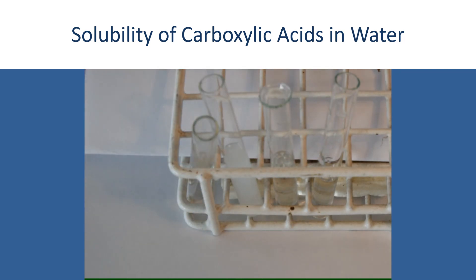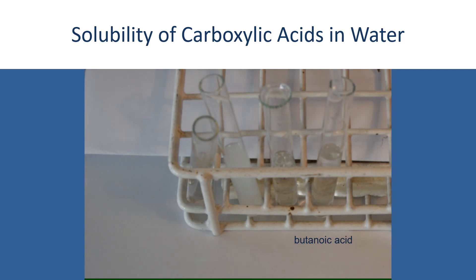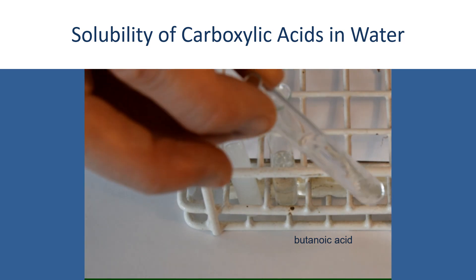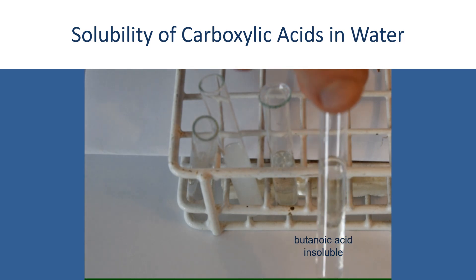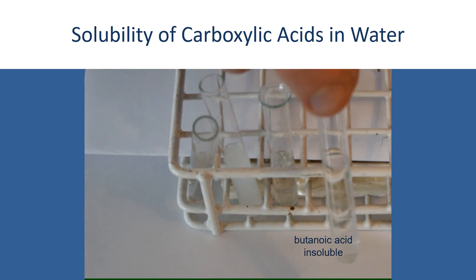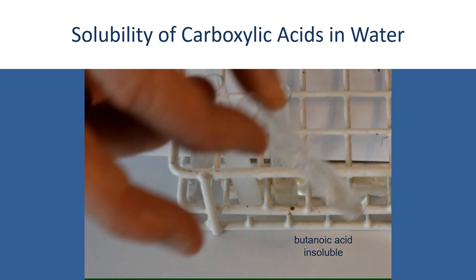And finally, to get the lid off butanoic acid — butanoic acid has a very characteristic smell, very not unlike vomit — and we'll add some butanoic acid to the water. I'll quickly return the lid to the butanoic acid. You can probably see there that the butanoic acid is sitting as a layer on top of the water. It's insoluble in water.